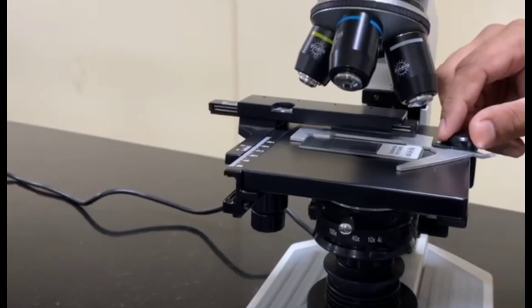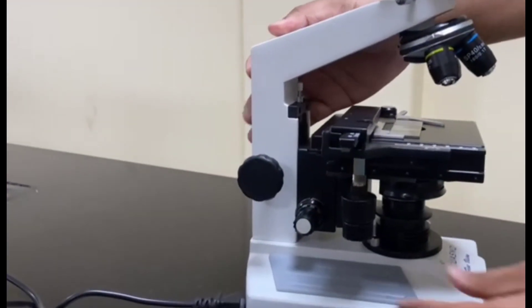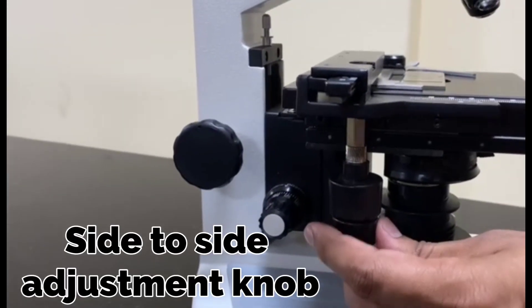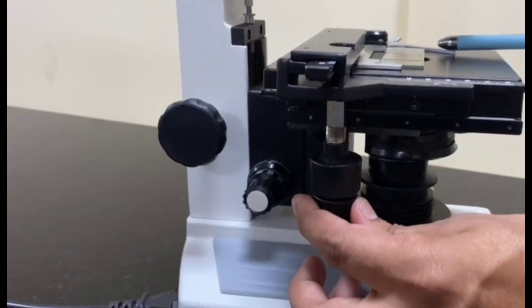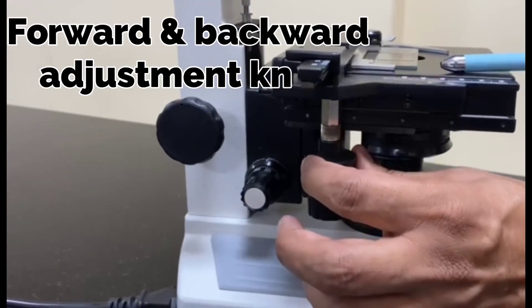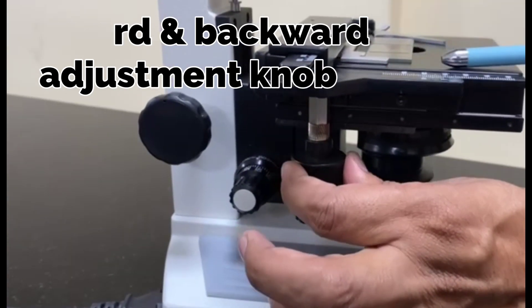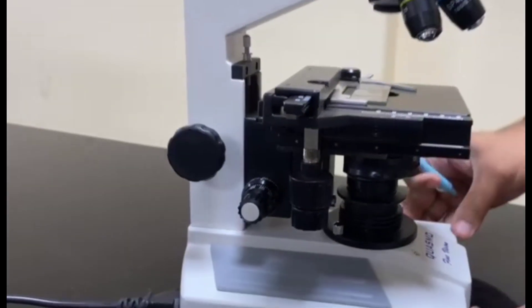Now come to these two knobs. The lower knob is used to move the slide laterally and medially, you can see that. And the upper knob is used to move the slide forward and backward so that you can adjust the slide just over the light.